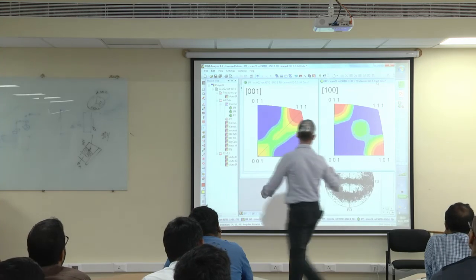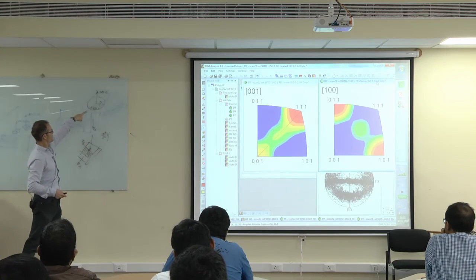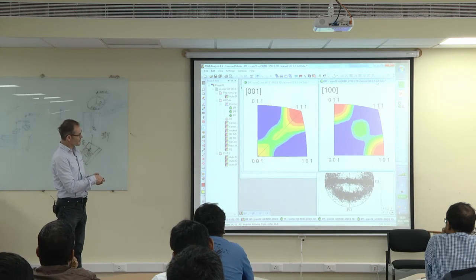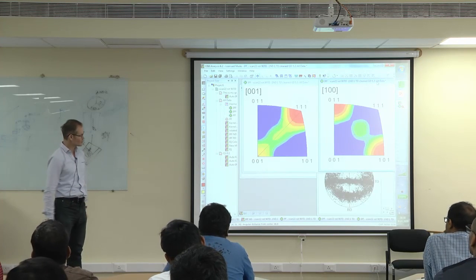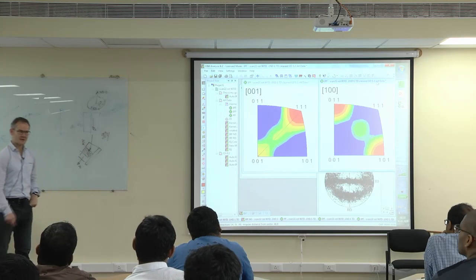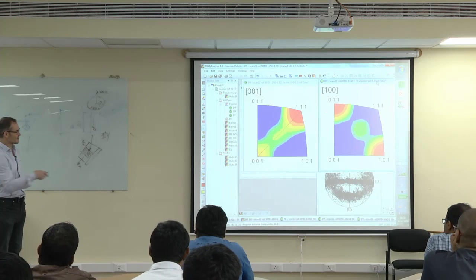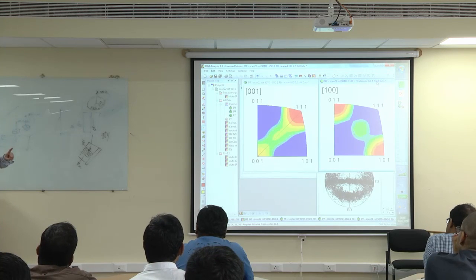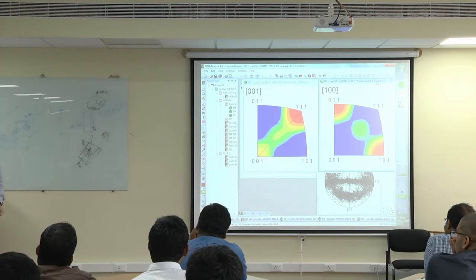But what we see now from plotting this pole figure, which is now indicating which crystals run in RD rotation, then we see, there is also a fiber, obviously. And this fiber, what does it mean? Actually, that the 011 crystal directions point into our fiber direction, into the 100 direction. And we have not yet seen this in all my plots which I have done. We have not clearly seen that this is the fiber. But the inverse pole figures, they show you clearly that there is a correlation between the direction of a sample and the direction of a crystal.